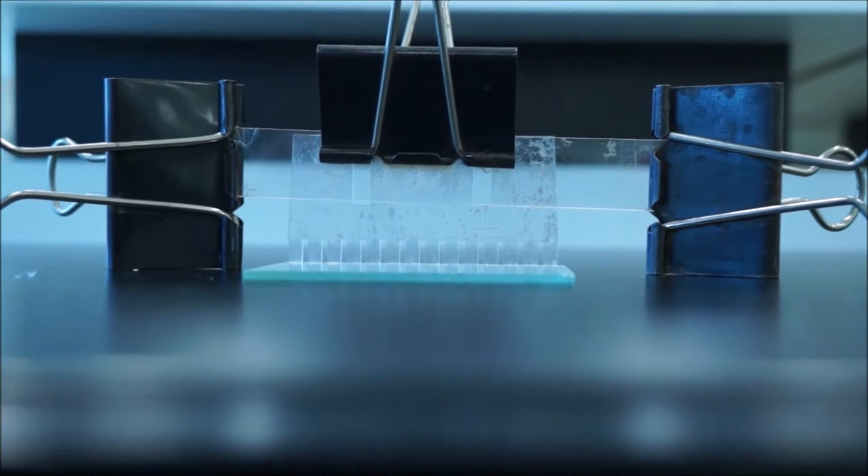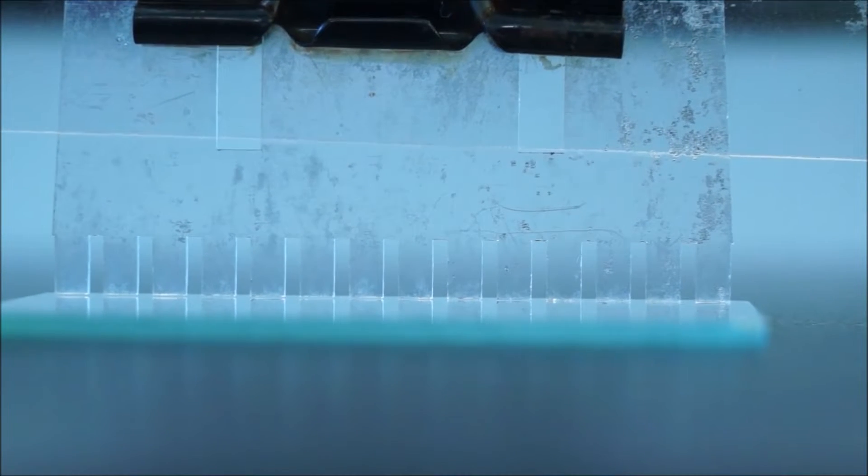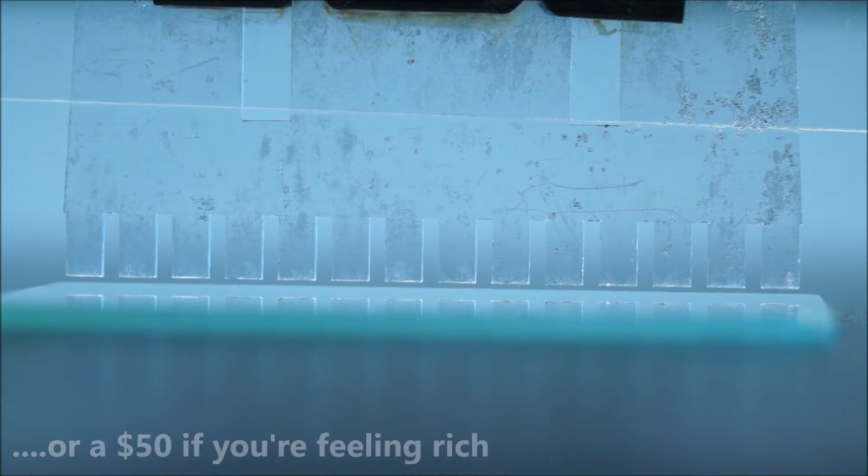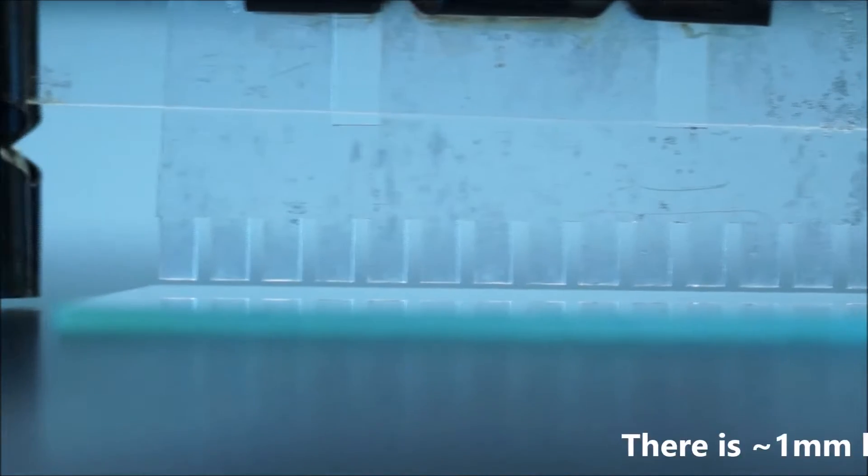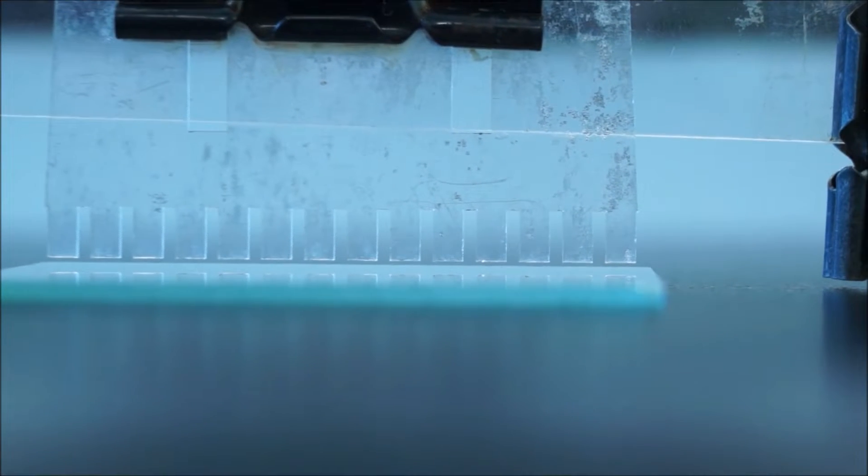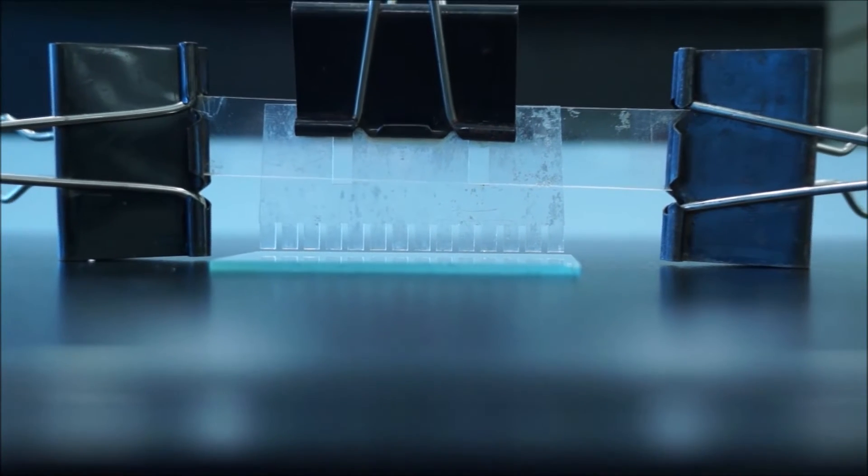What you want to do is get down at the level of the bench and look along the glass slide to make sure the comb isn't quite touching. This one's currently touching, so we need to adjust the bulldog clips so there's enough space that you could slide a $20 note underneath it - perhaps a millimeter or so. Let's see what I've done to the bulldog clips. The bulldog clips are now at a bit of an angle.